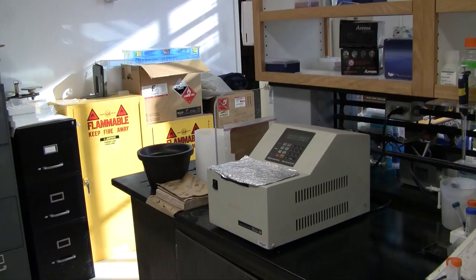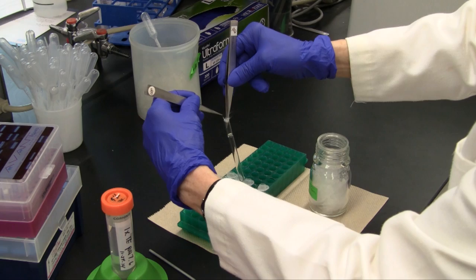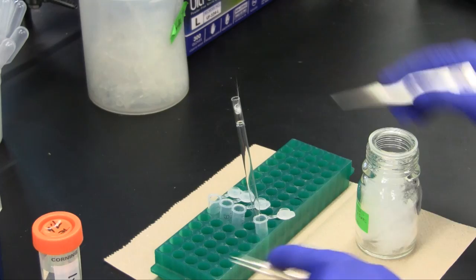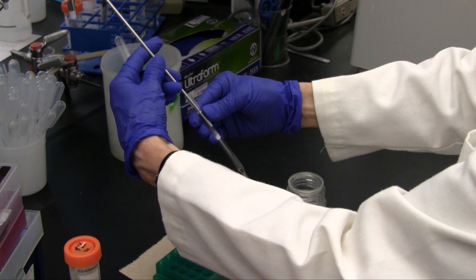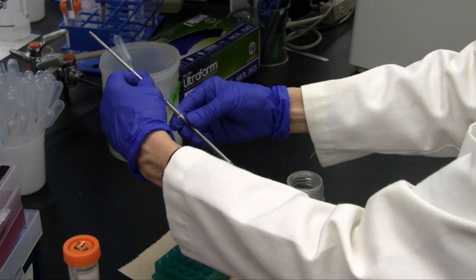Following nick translation, probes must be purified before they can be used in the FISH procedure. While green and blue probes can be purified with only an ethanol precipitation, red and far red probes must be purified with column purification to remove unincorporated dNTPs. The column is prepared by first removing a small amount of silane-treated glass wool and placing it carefully in the top of a Pasteur pipette. The handle from an aluminum inoculating loop is then used to tamp the wool into position at the bottom. The work is performed over paper towels to collect any stray glass fibers, which could be harmful if handled or inhaled.